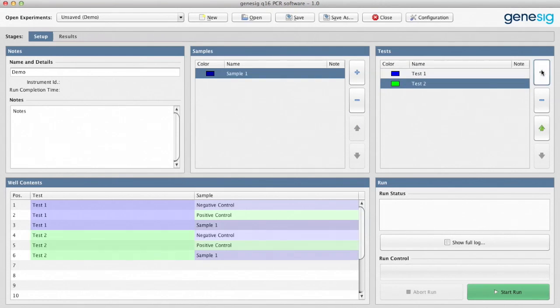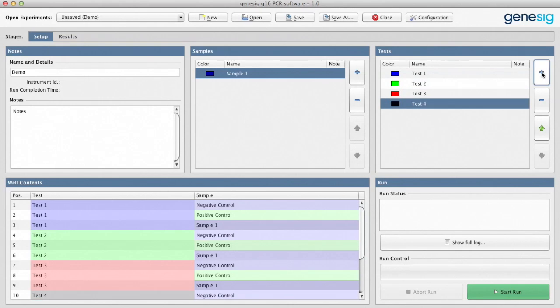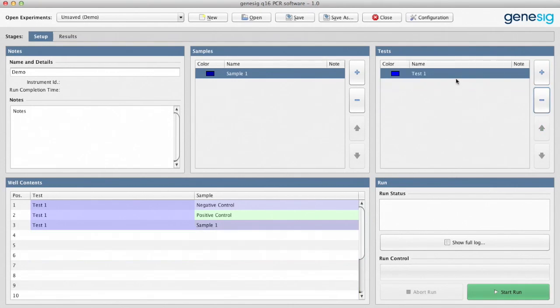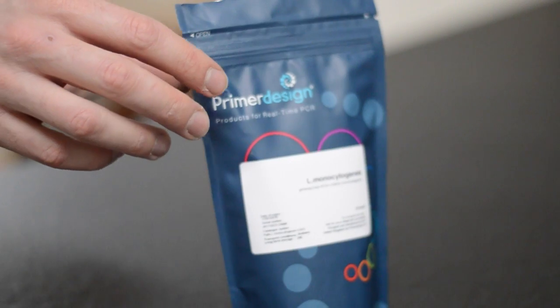In this panel you can define how many different tests you're doing. For example, you may want to test for Listeria and Salmonella at the same time. But again, let's keep things simple and for now just have the one target. Again, just adjust the label here.